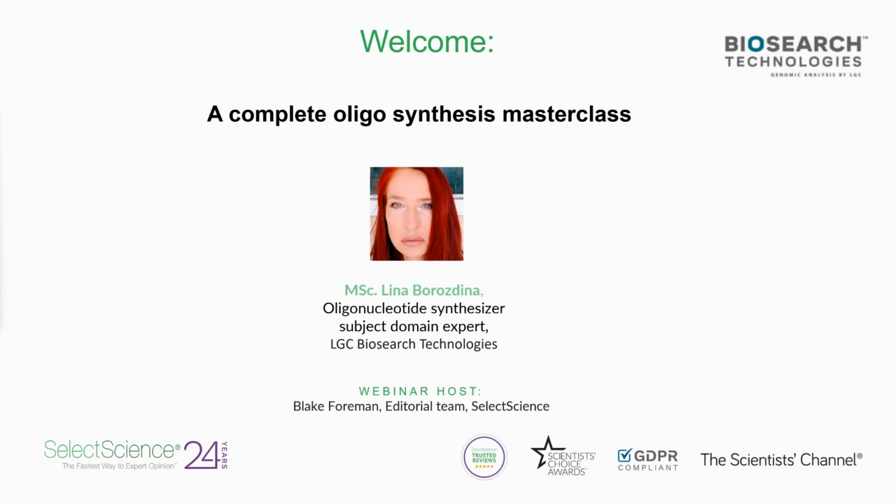In this webinar, we will cover a complete overview of the oligosynthesis process, from chemistry-based basics to the latest reagents and techniques used and post-synthesis considerations. We will also cover how to select the right oligosynthesizer model for your research and what you need to set up your laboratory correctly for safe and efficient oligosynthesis.